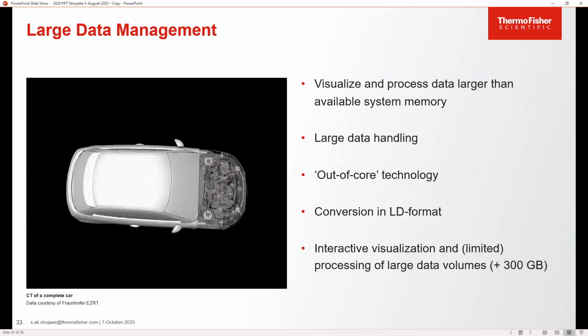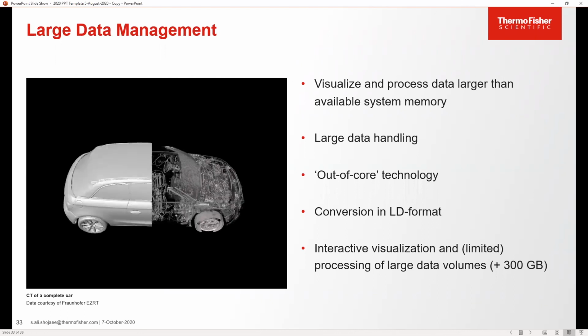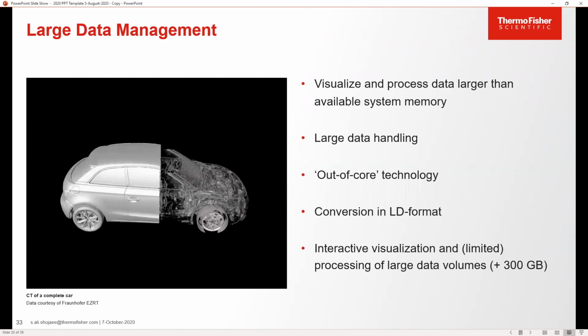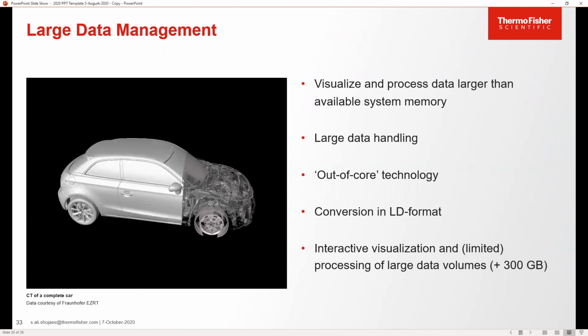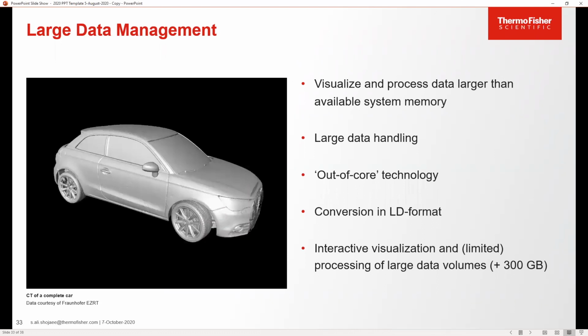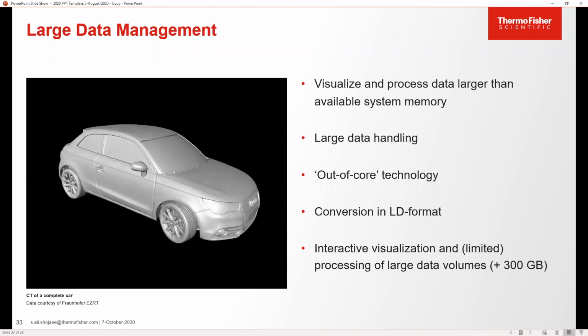I'm going to finish by talking about handling large data, and then just a very quick slide about the other things that are available. So large data, what is large data? Anytime your data is larger than the memory of your computer, it's large data. If you have this CT of a complete car, it's probably a few terabytes. That is large data for any computer. If your laptop has 4 gigabytes of RAM, data that is 5 gigabytes is large data.